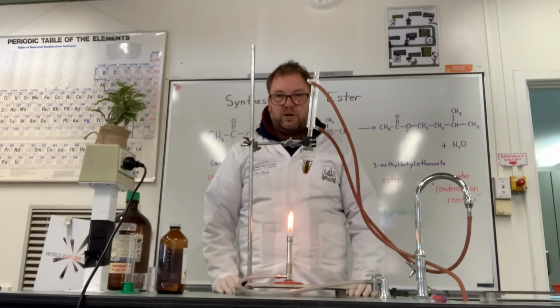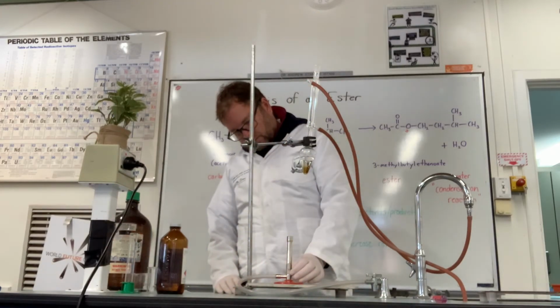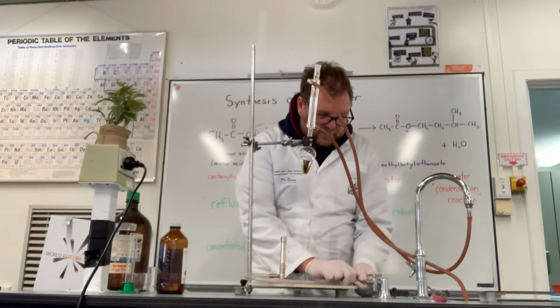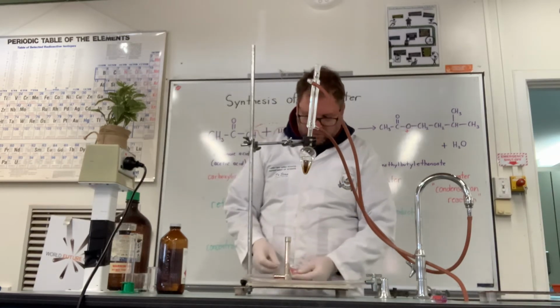I hope I haven't got a dodgy Bunsen burner here. It's not got much go about it. And it went out. Okay, I'm not really winning here today. This often happens. I'm just going to try this side. Sometimes the taps are a bit blocked. Well, I'm not real hopeful.